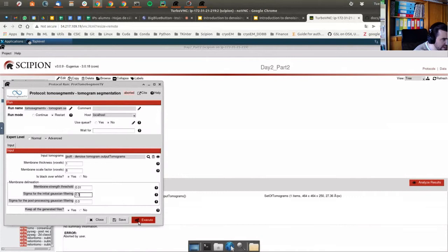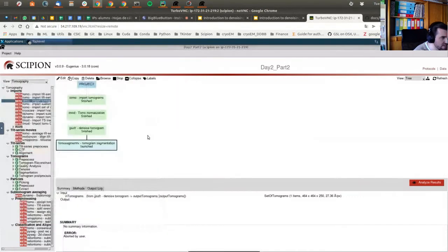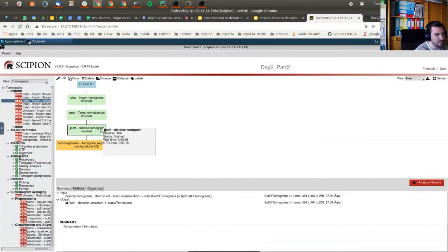Now it seems to be working fine. Many thanks again, Mohammed. Could you please again explain about the denoising step? Is it just a Gaussian blur applied to the images just to see them better?